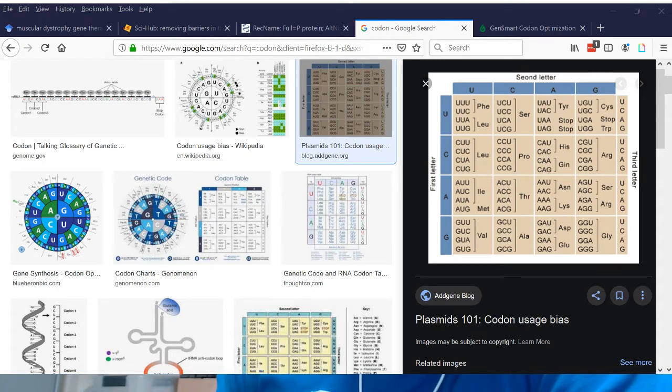Now, HindIII is always on the other end. It's weird to see it there, but it's a pretty popular enzyme. Let's use HindIII and XbaI, right? Oh yeah, let's cut out a big chunk of this. All right, so XbaI. Here's what the restriction site looks like, TCTAGA.